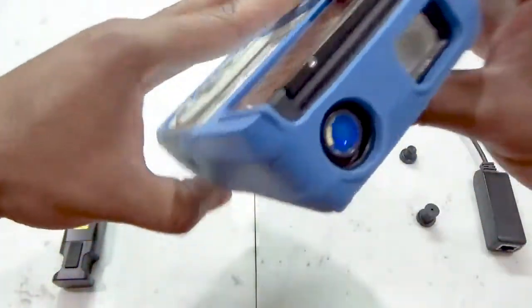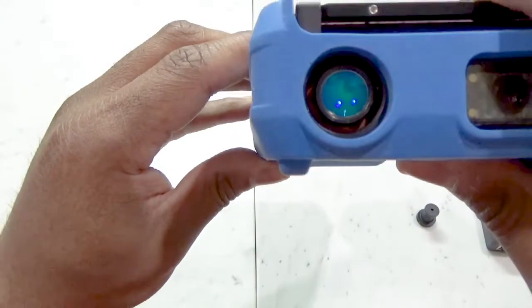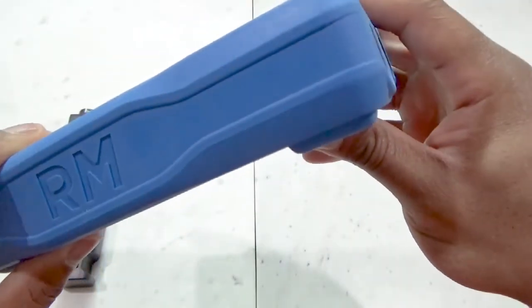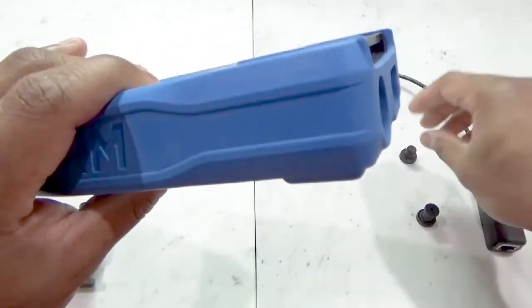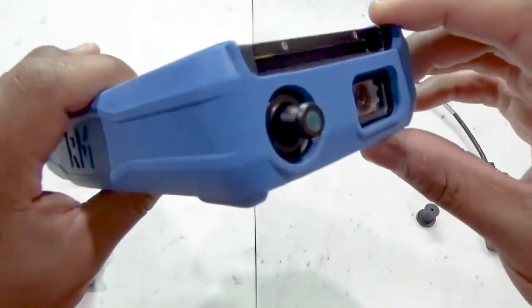This is the laser aperture. TruScan uses a 785 nanometer laser at 250 milliwatts of power. TruScan's laser is at a fixed focal point from the aperture exit to allow penetration past the container's primary packaging. When using the normal nose cone attachment, the focal point from the laser aperture does not change.